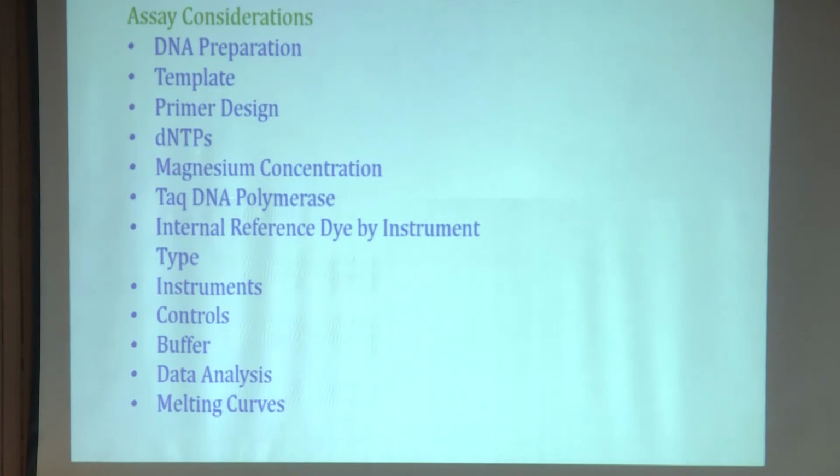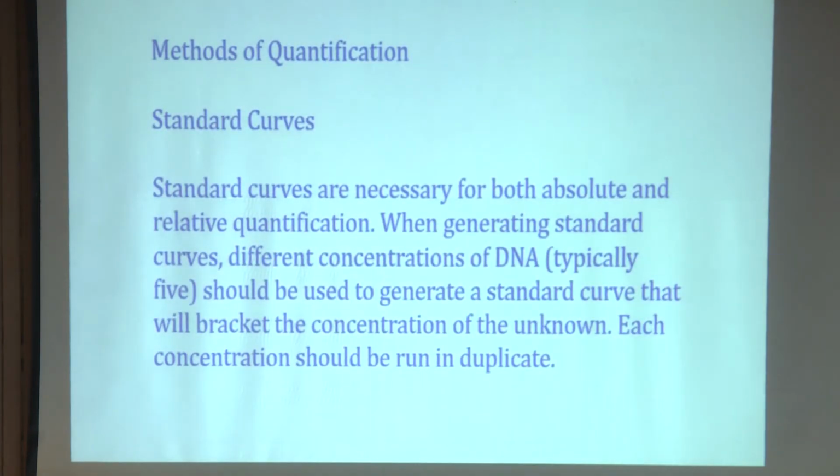Nowadays this is available in the software itself, so you can have an idea whether you are only getting amplicons or some other dimers are also appearing in the melting curve. These analyses have to be done. Well, a couple of runs you have to do without actually going for the actual quantification of your gene, and then start your experiment and prepare your standard curve.